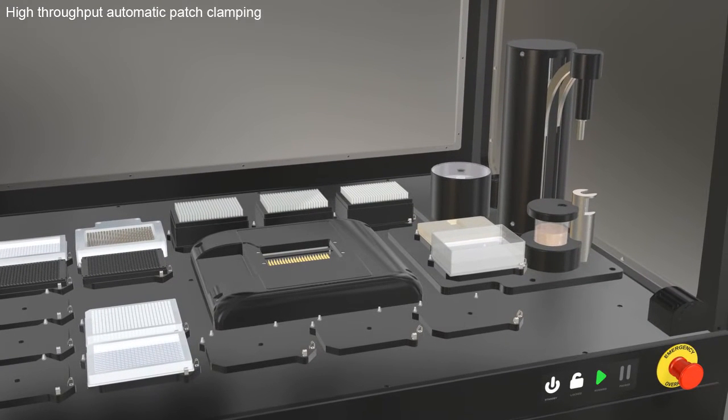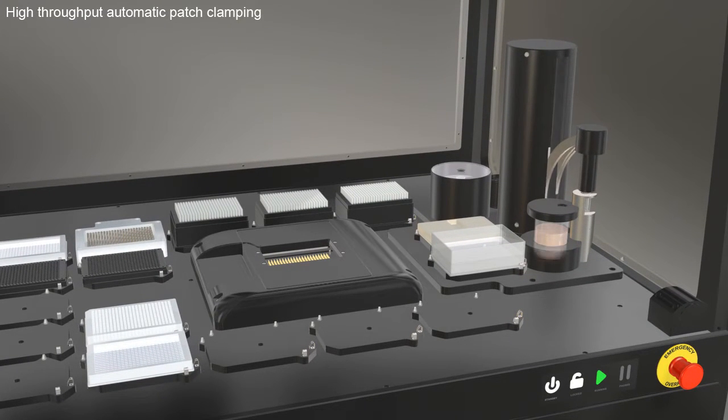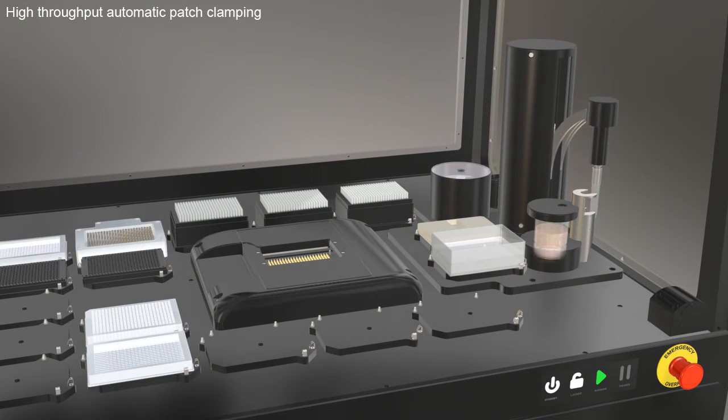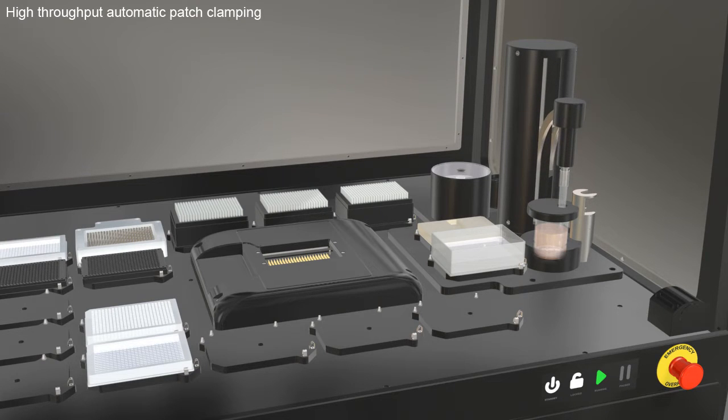On the automatic cell preparation station, known as the ACP, the Q-Stirrer can keep the cells in suspension for at least four hours.